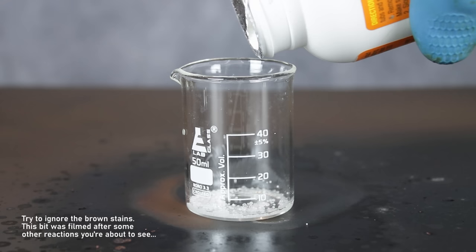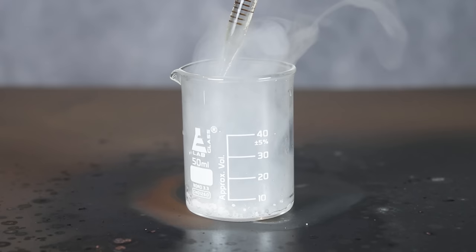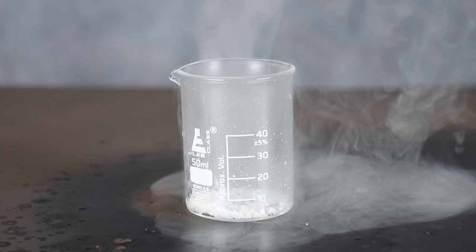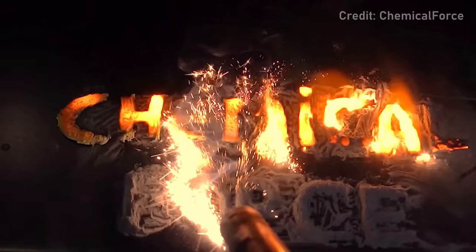Now, if ammonia is a weak base, what happens with a stronger base? For example, solid sodium hydroxide. Honestly, this wasn't terribly violent, since little to no water was present, but it was still exothermic enough to be interesting.